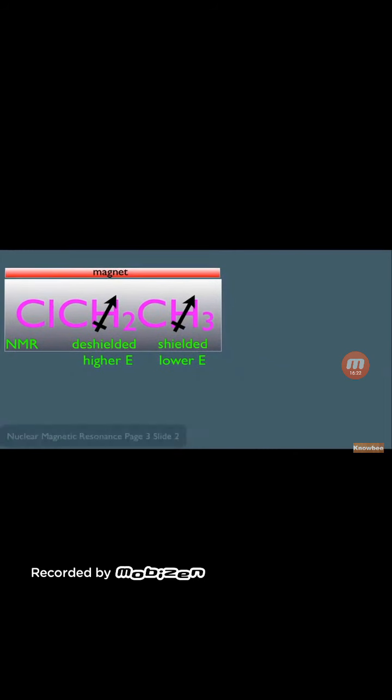Well, let's see here. Let's label our hydrogens first. Remember, let's call this guy the A hydrogen, and we'll call these 3 hydrogens the B-type hydrogens. Putting this sample molecule in the H-NMR would give us a spectrum that looks like this. We can expect to see 2 signals in it. Remember, one for the A-type hydrogens, and 1 signal for the B-type hydrogens.